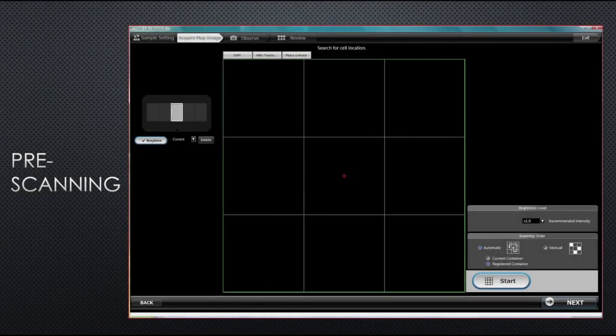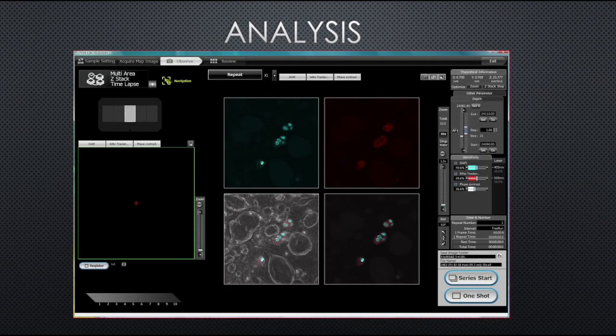The area of study is identified and registered using the controls on the left. A slide is then placed in the sample holder. By pressing start, the confocal then begins imaging. Since the image is created slice by slice, this process may take a few minutes. Once the image is produced, this screen is seen. The level of magnification can be increased from 10x to a maximum of 180x using this magnification button and scale.